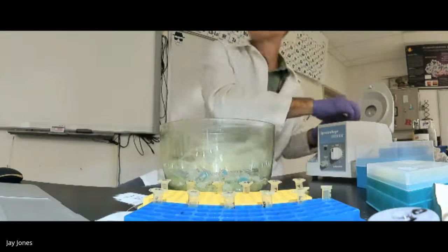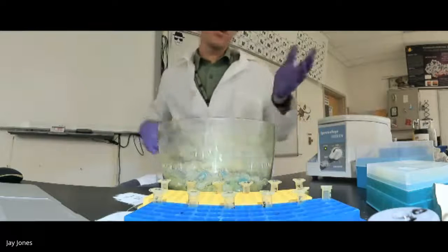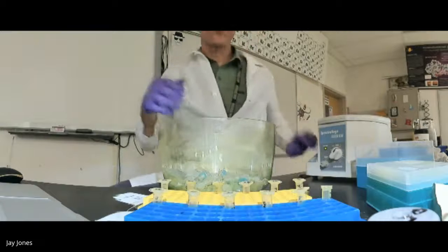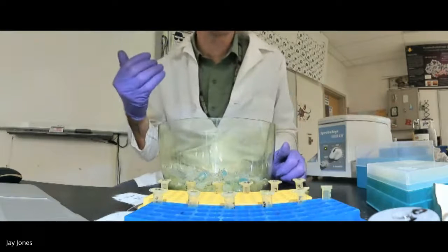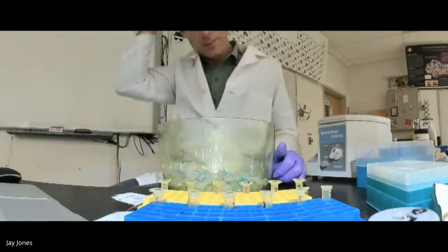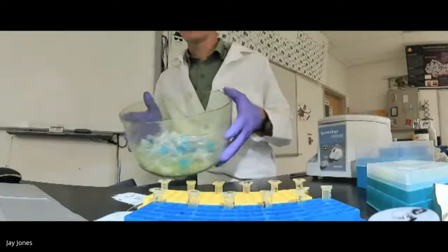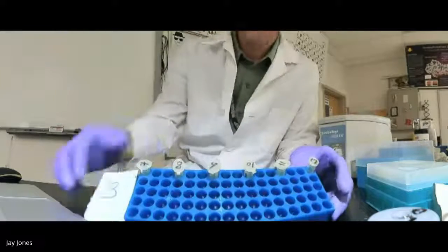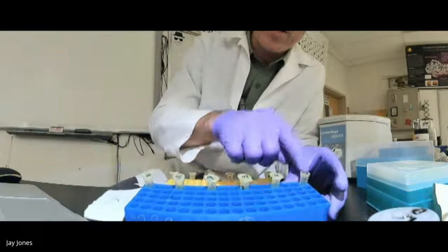We're going to spin them again for a minute just to make sure all that ethanol is through. This is called the insurance step, because we want to make sure all the ethanol flowed through. So I'm going to spin it again, and I actually might have a tiny bit more ethanol that flowed through the column. This is my dump bucket. This is big dump. Now, I have these final collection tubes. These are critically important. I cannot knock these over.